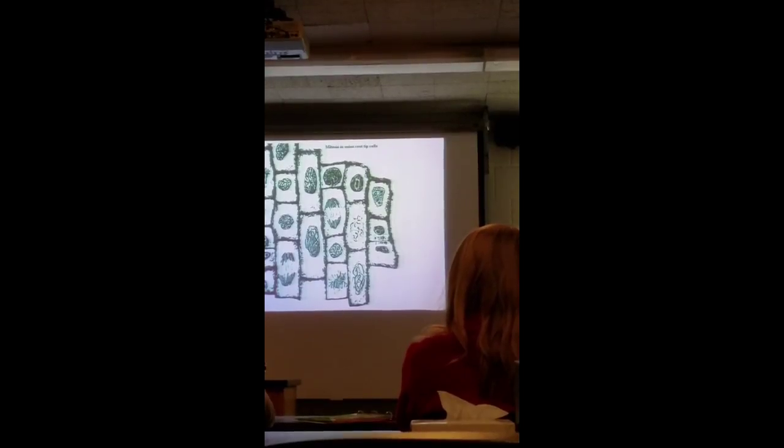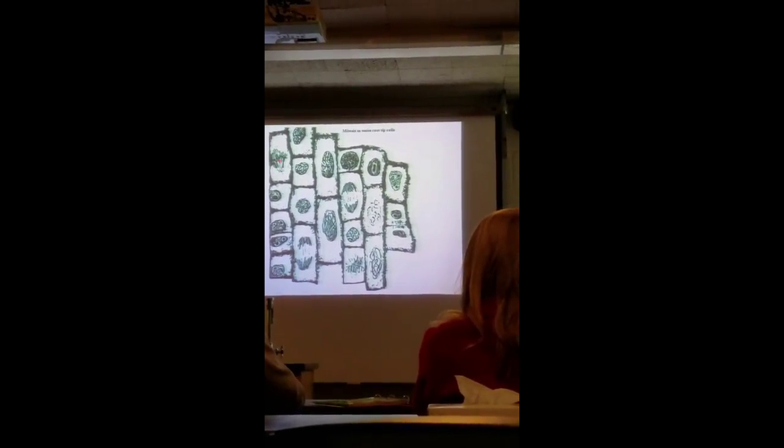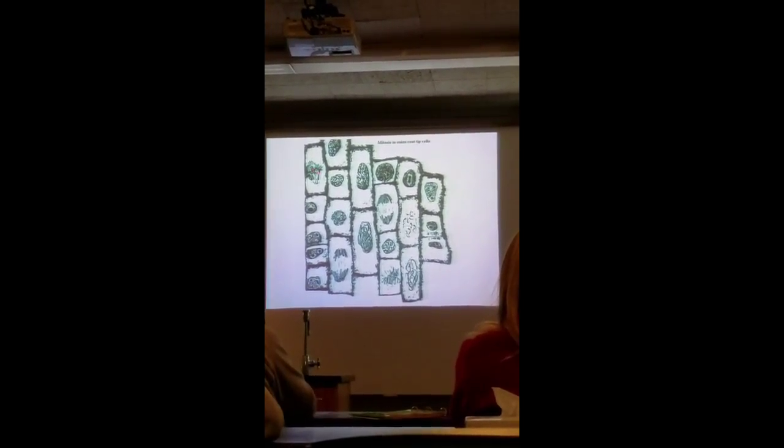This is where you guys can do a little thing on your notes. What's this one? Alignment at the equator is metaphase. Meta, middle. Think about it that way, yeah.